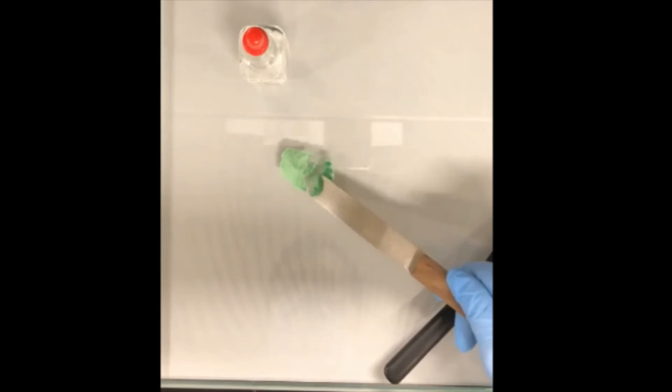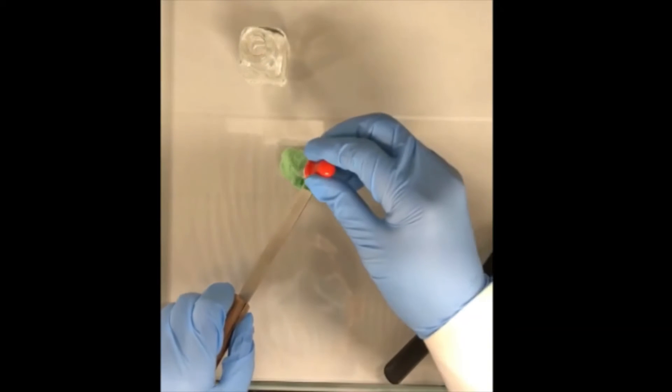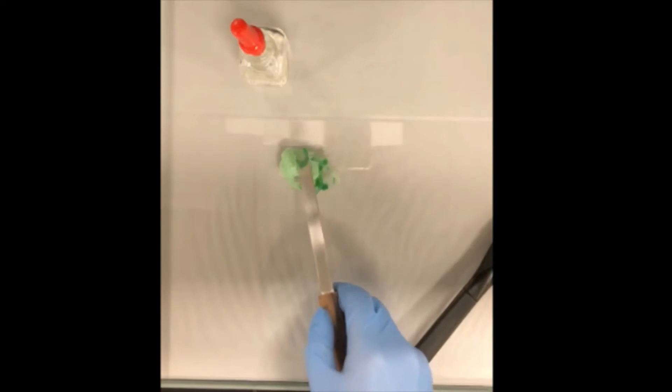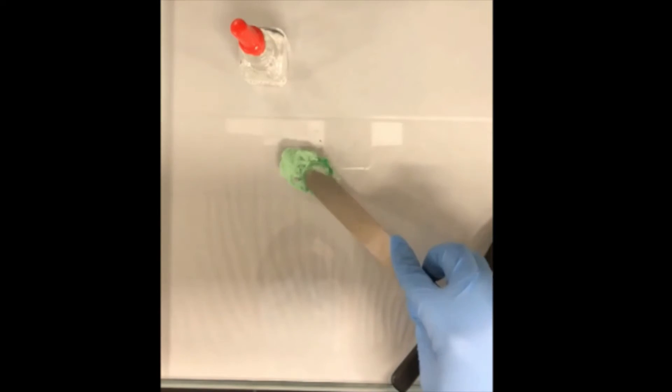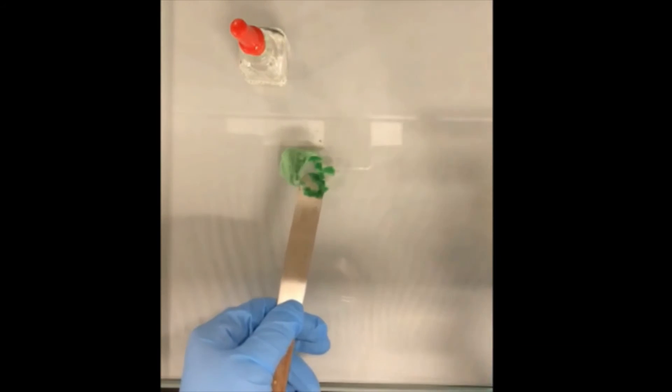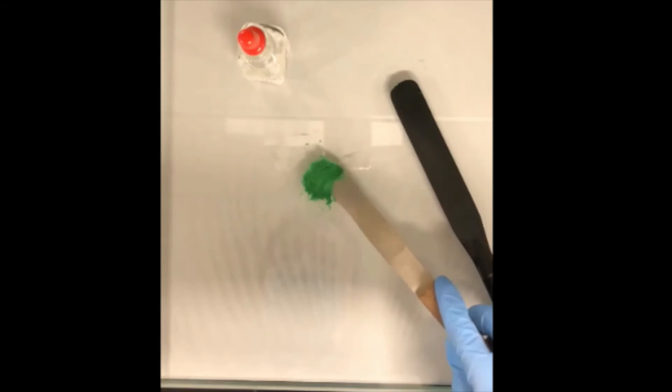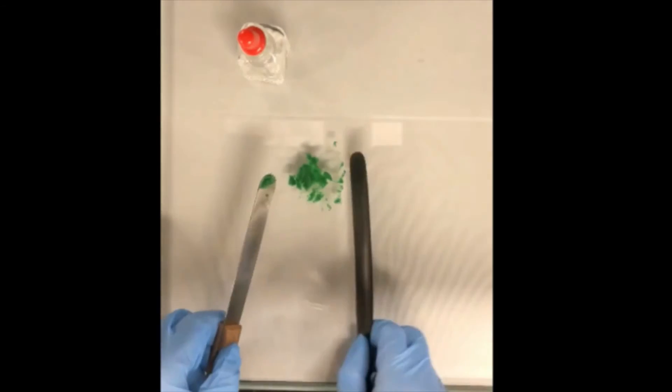So, the powder will be spatulated into the levigating agent. How to decide the amount of the levigating agent? The general rule is to use as minimal as possible. We can repeat the process until all the solid has been incorporated with the levigating agent. So, we can repeat the process.